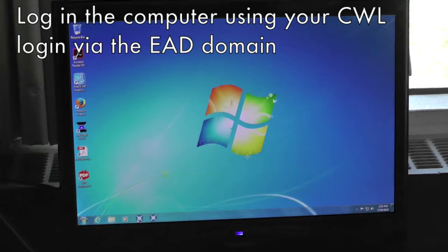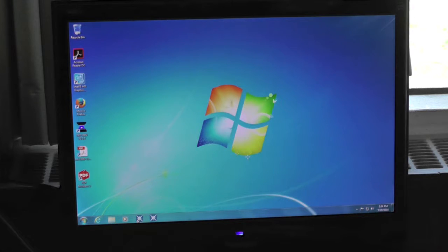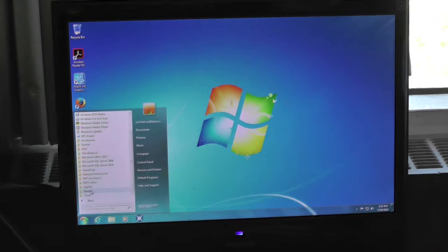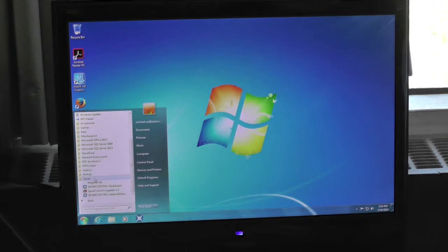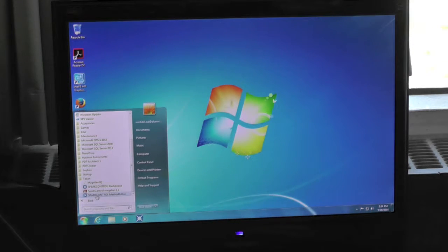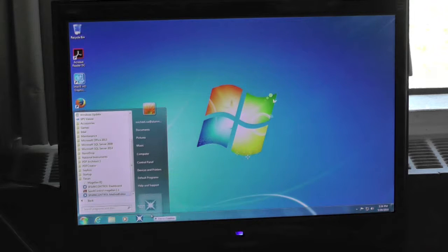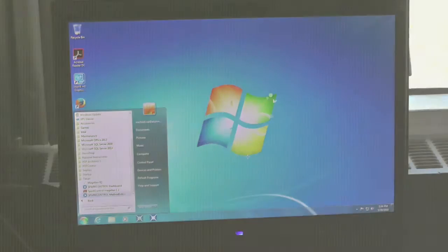In order to log on the computer, please use your CWL login via the EAD domain. For the very first time, go to the start menu, then look for T-CAN under Program and pin the program SparkControl onto your taskbar. This will then be available upon login afterwards.